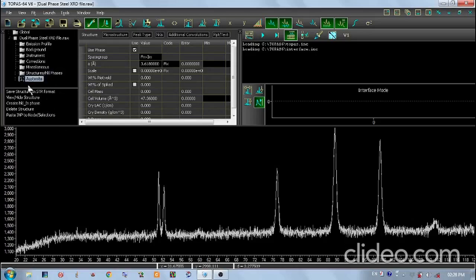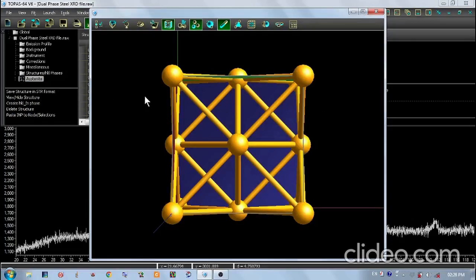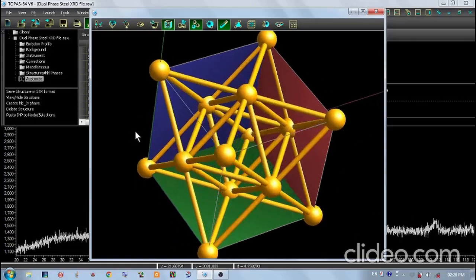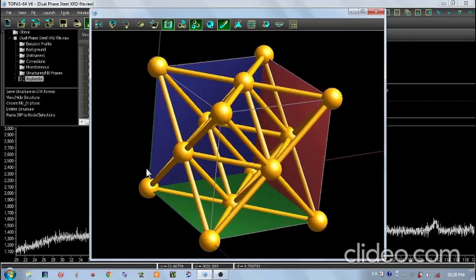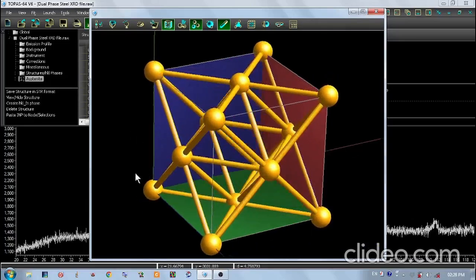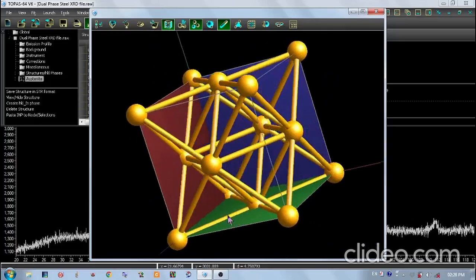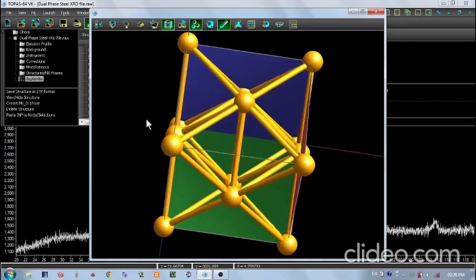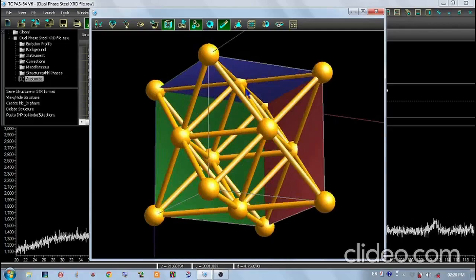Okay. From here, by clicking on this austenite, we can see the FCC structure of the CIF. So let's click on view or hide structure. From here you can scroll, you can drag, and you can see that this is an FCC structure. So we have ensured that this is really an FCC structure.